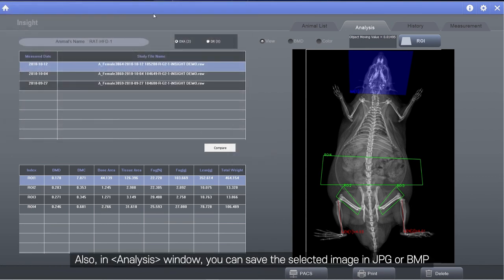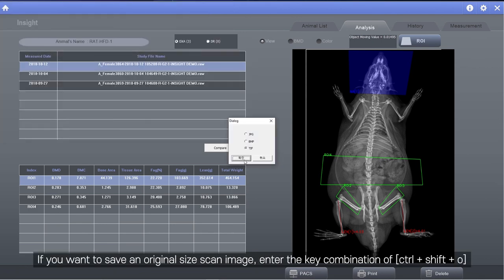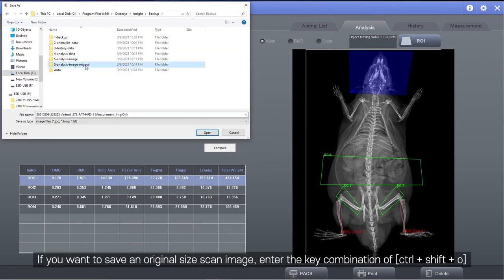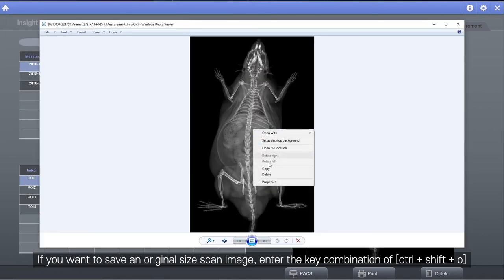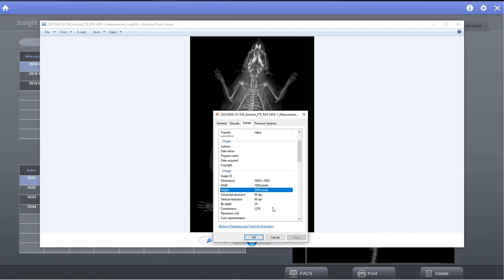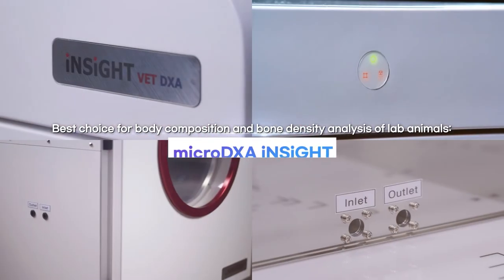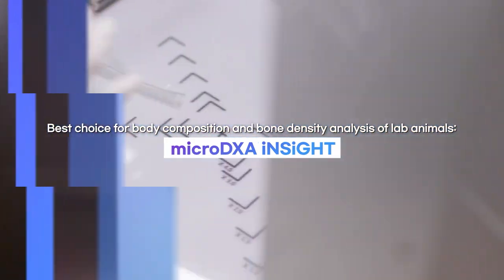Also in analysis window, you can save the selected image in JPG or BMP or TIF file by entering the key combination of Ctrl-Shift-I. If you want to save an original size scan image, enter the key combination of Ctrl-Shift-O. Best choice for body composition and bone density analysis of lab animals, microDXA iNSiGHT.